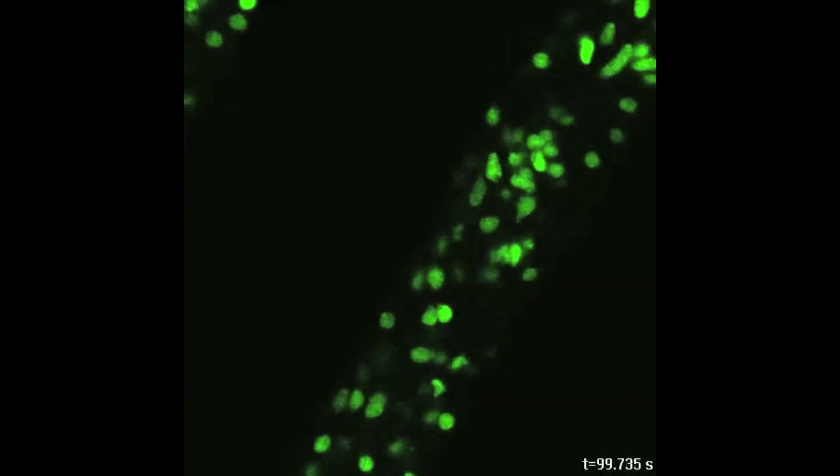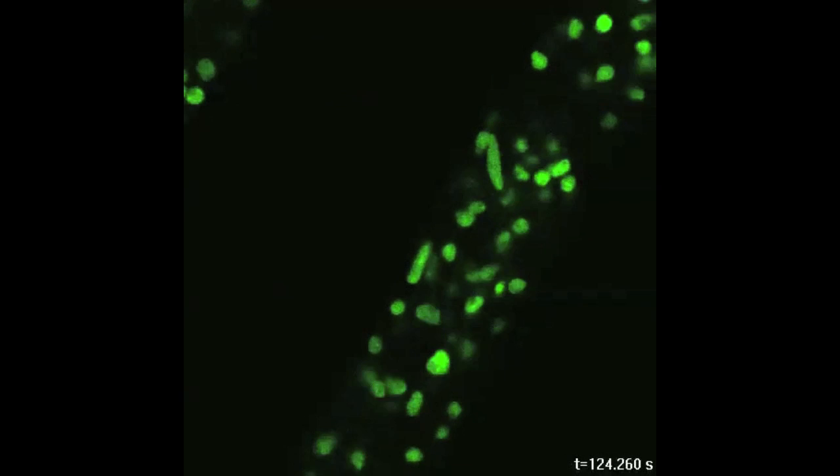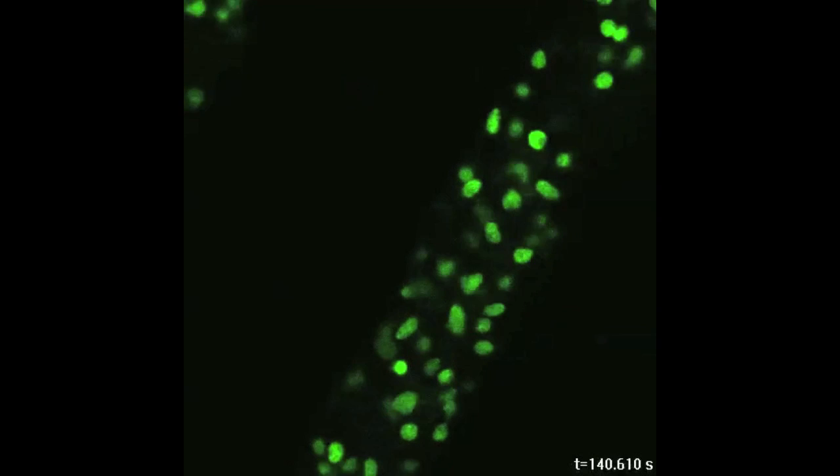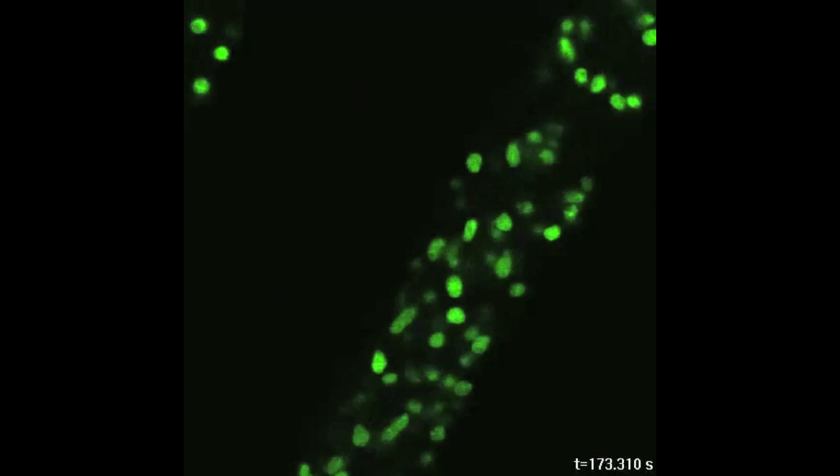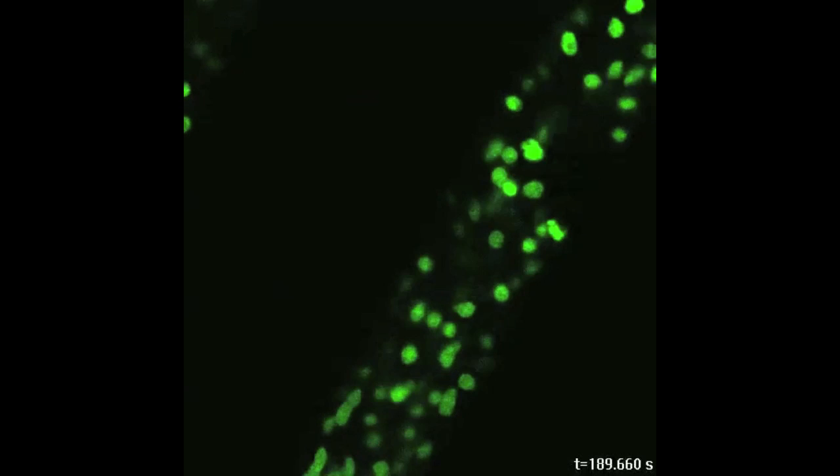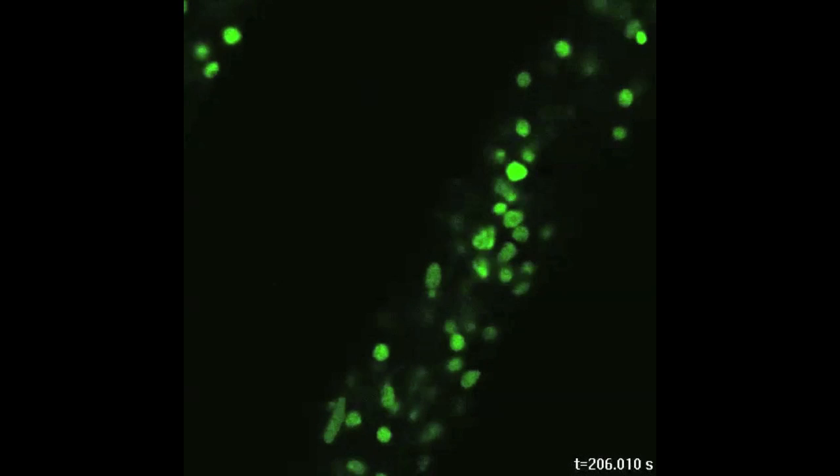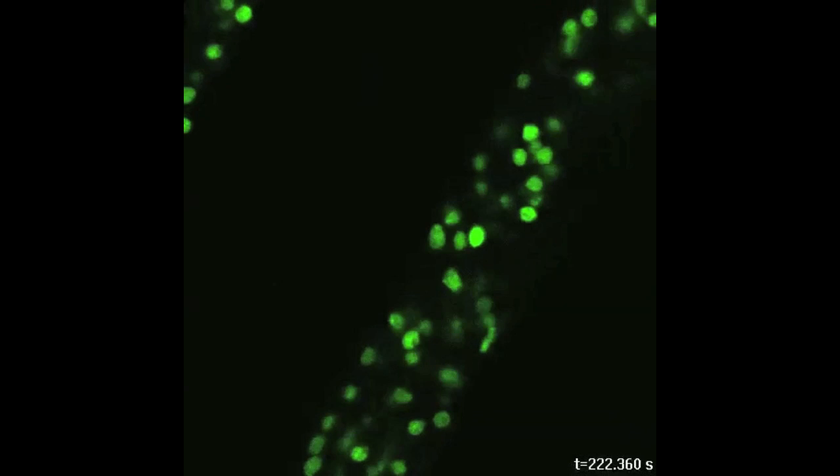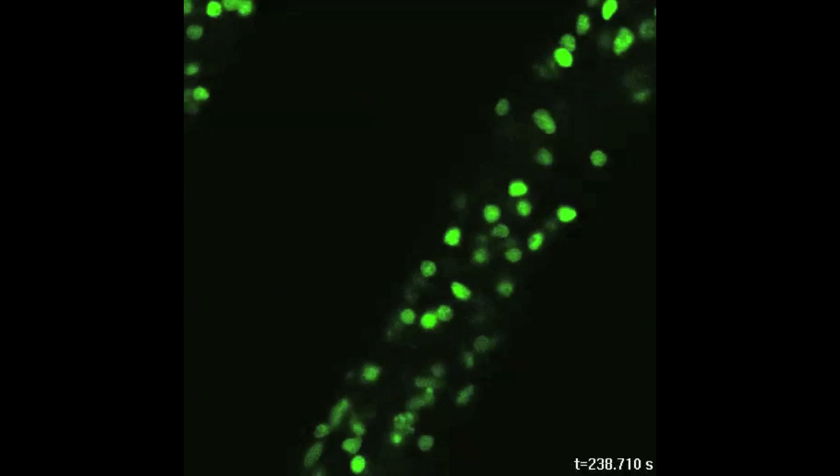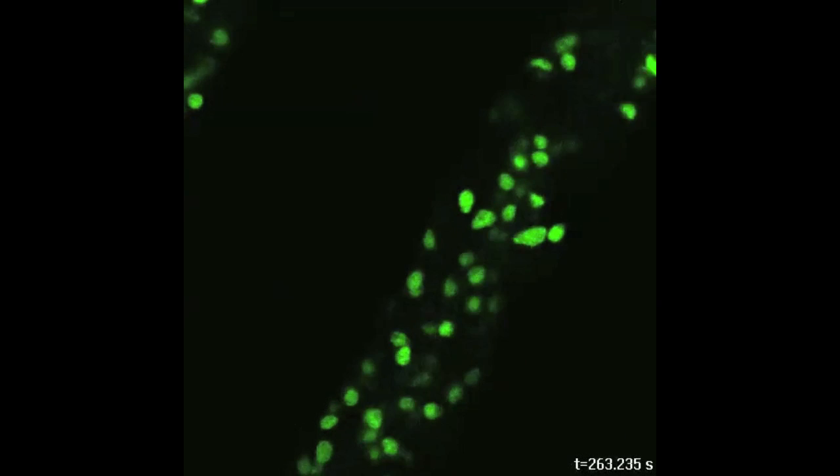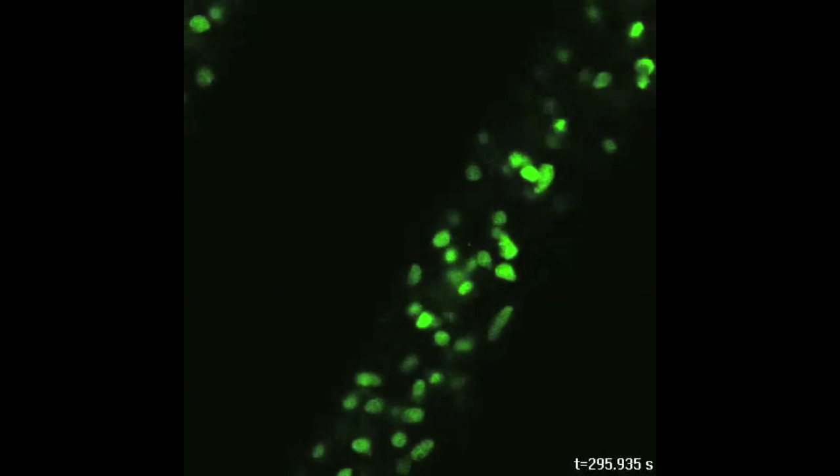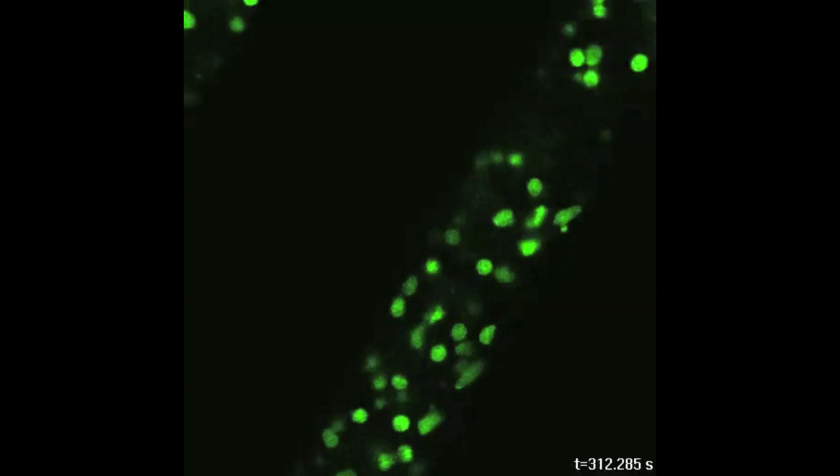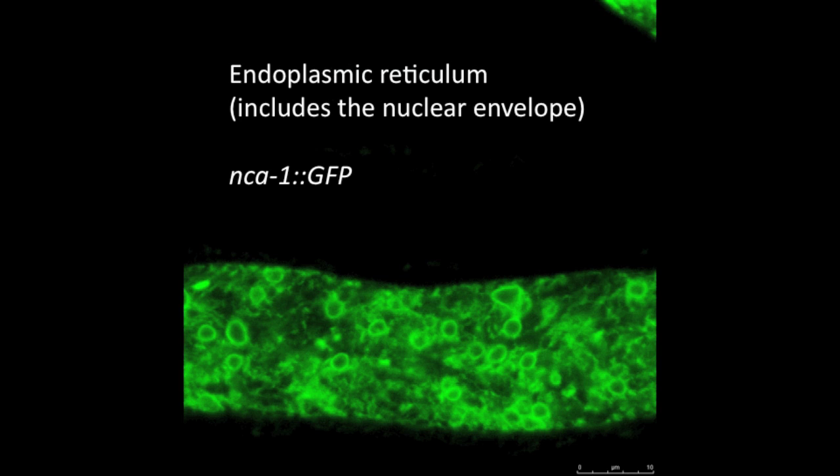We start with nuclei, which are shown in this video clip. As is typical in filamentous fungi, there are multiple nuclei in a single cellular compartment. There can be 50 nuclei or more. They're all moving towards the growing tip, which is down at the bottom of the picture, although you find an occasional one that moves backwards. We don't really understand what causes this backward movement, but most of them are moving on towards the tip.